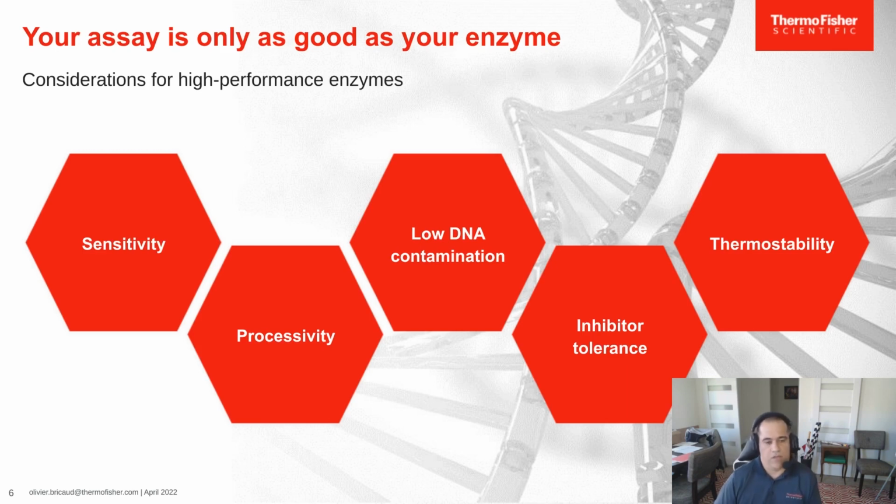Moving on and going back to our RT and PCR enzymes, before thinking about lyophilization, we really need to think about the enzyme. When we look at any type of assay, the assay is only as good as the enzyme. If the enzyme doesn't perform correctly, then the assay is not going to perform correctly.